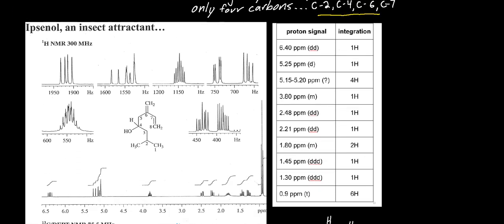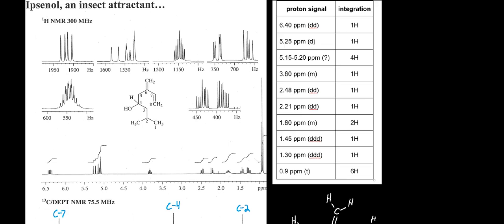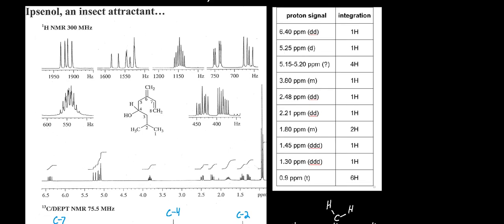So I hadn't shown the proton NMR for ipsenol. Here it is. I don't know why they use Hertz values on these, but these are expansions of all the individual signals in the spectrum. And what I've gone ahead and done is made a table of the proton assignments.